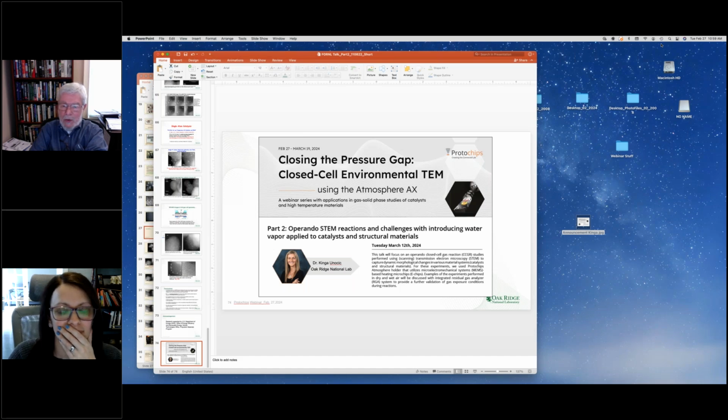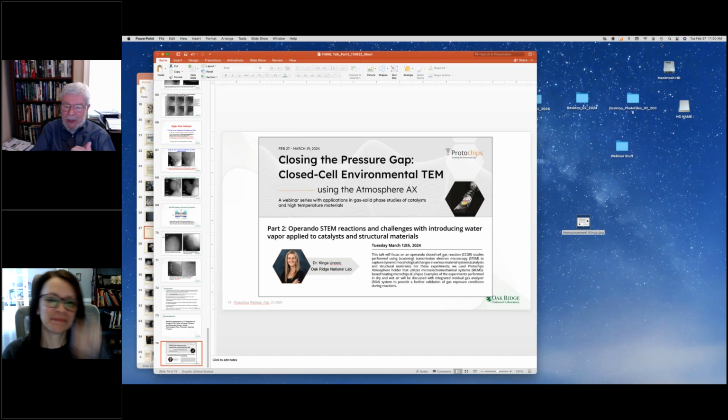that is done in a holder that you're heating up, the entire holder in the E-TEM environment, at lower pressures, of course, sometimes of which are desired, but they can have enough catalytic material in the structure around the grid that holds the sample that they can get actual reactions because of the volume of gas that's around the sample and the whole area is heated up, that they can then start looking at the composition of the reactants, what the reaction is showing.